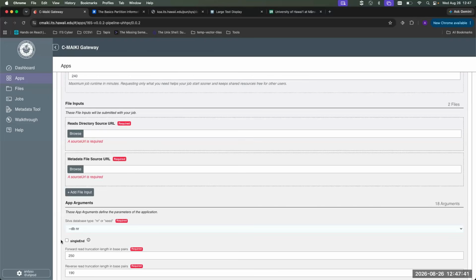So the gateway is designed for people who are not fluent in command line. And so we have set protocols for ITS and 16S because those are the most commonly used ones. We also have protocols for CO1, and we have a couple other pipelines, like an 18S specific pipeline. Most of this, I mean, the ITS one, I think, has only been used by a couple of people. So the main workhorse here is 16S.